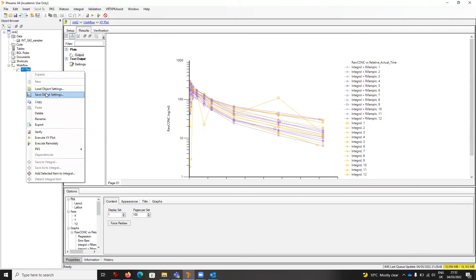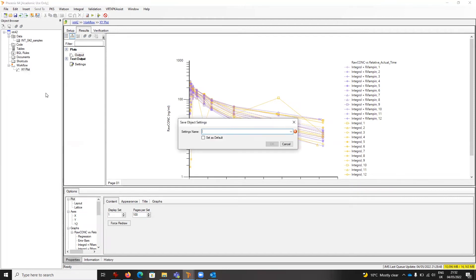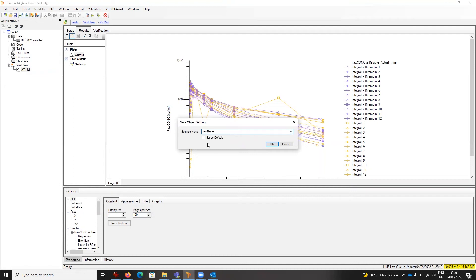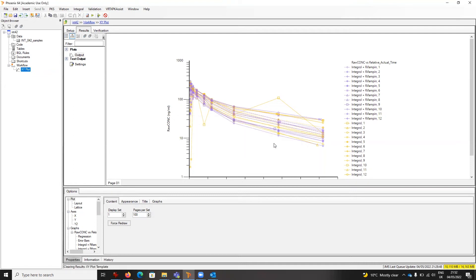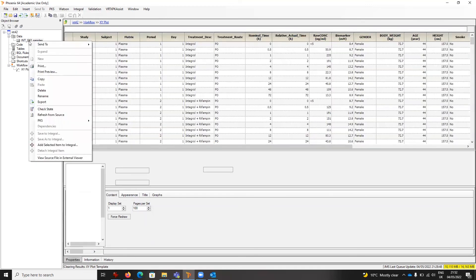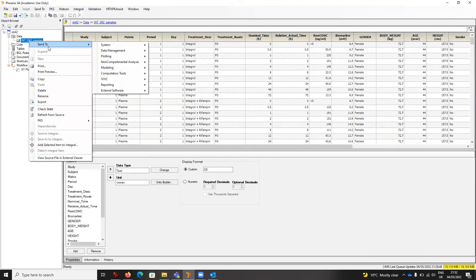Save Object Setting. I can use the existing name or set a new name. I can set as default and say okay. What that means is now anytime I make an XY plot, the defaults set are now New Name, so I just have to click execute.